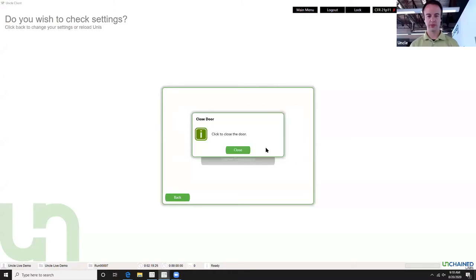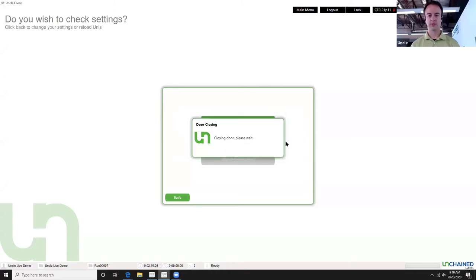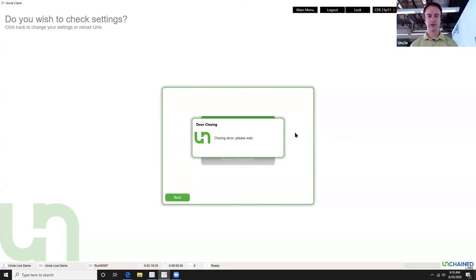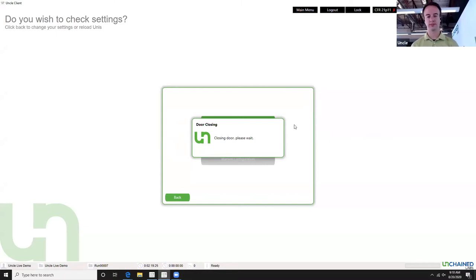Loading samples and closing the door — that's it. All that's left is to hit the quick start button and the UNCLE will take it from there and run the experiment that we designed on this sample. We're going to shift over to UNCLE Analysis and take a look at what these results will look like.